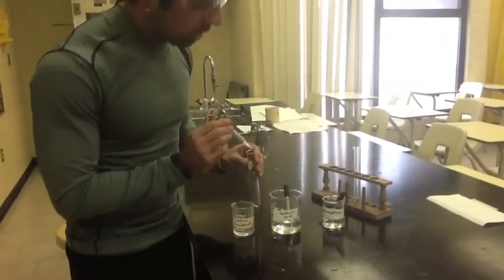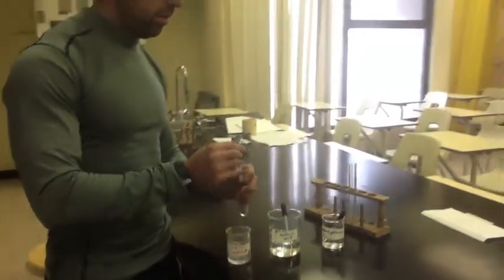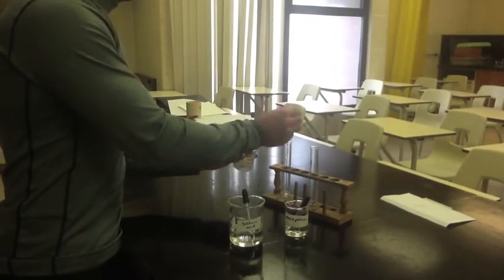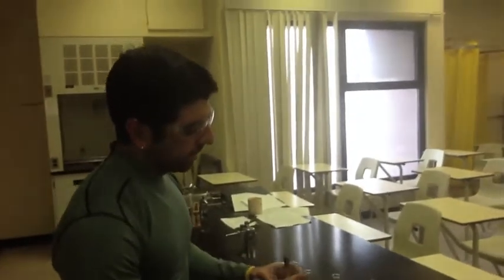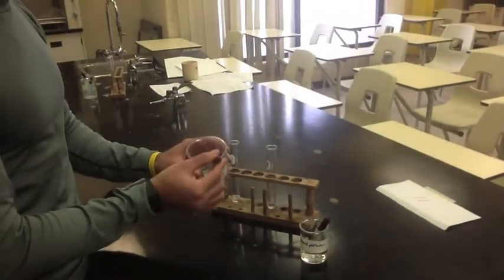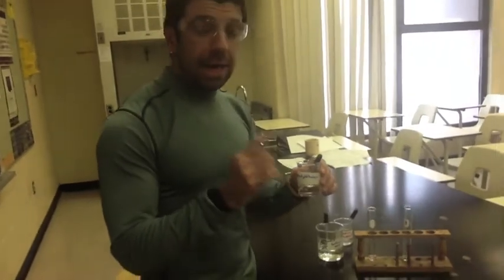So we've got sodium hydroxide. I've got sodium hydroxide in one. Let me put one more. So 3 eyedroppers full of sodium hydroxide. And we're going to do 3 eyedroppers full of sulfuric acid. And we already know which one is an acid or a base. But the one thing we want to identify in this one is how does an indicator like phenolphthalein indicate acids and bases?